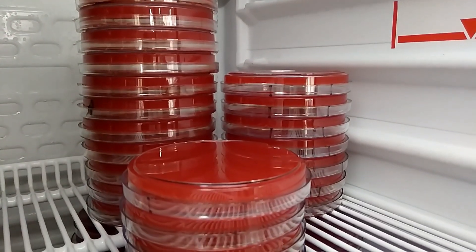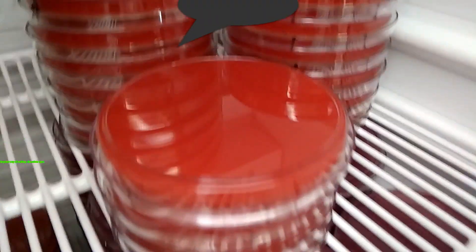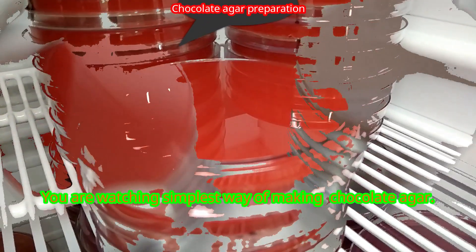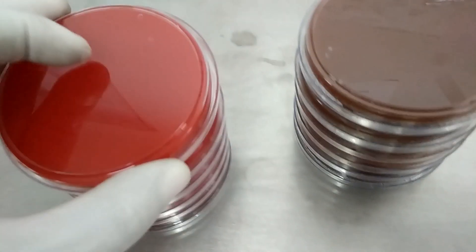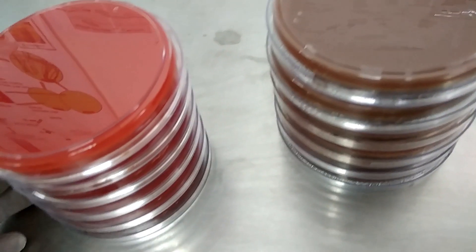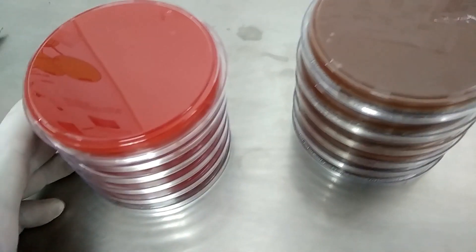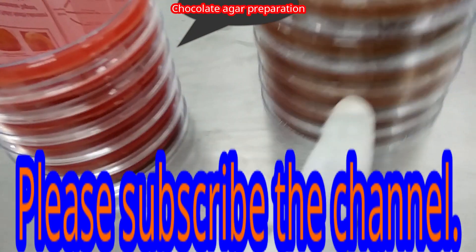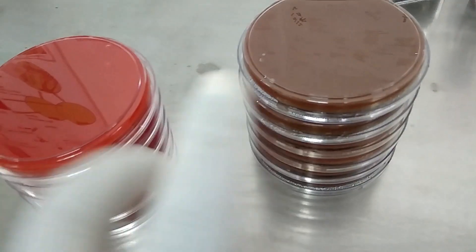Hello everybody, you are logged in to Micro Hub Plus, and watching a very simple way of making blood agar to chocolate agar. Here we can see blood agar plates, and we have to change these into chocolate agar.